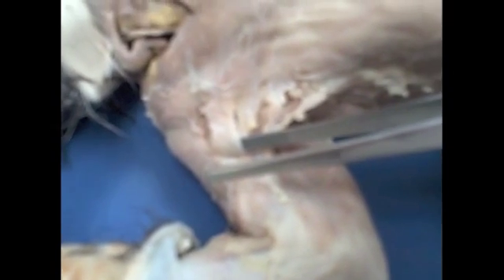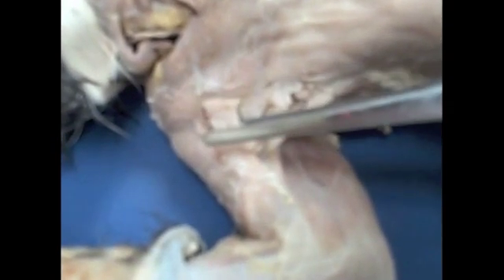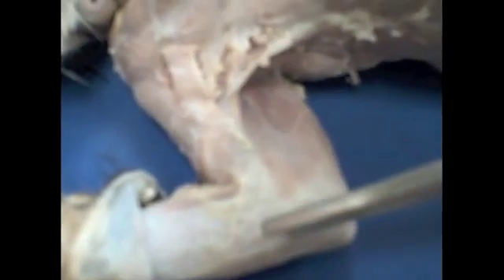Here's the dividing line between the major and minor. So here is the pectoralis major, and it originates in the sternum and inserts in the humerus. Over here is the pectoantebrachialis, and it originates in the manubrium and inserts in the fascia of the ulna, which is near the elbow.